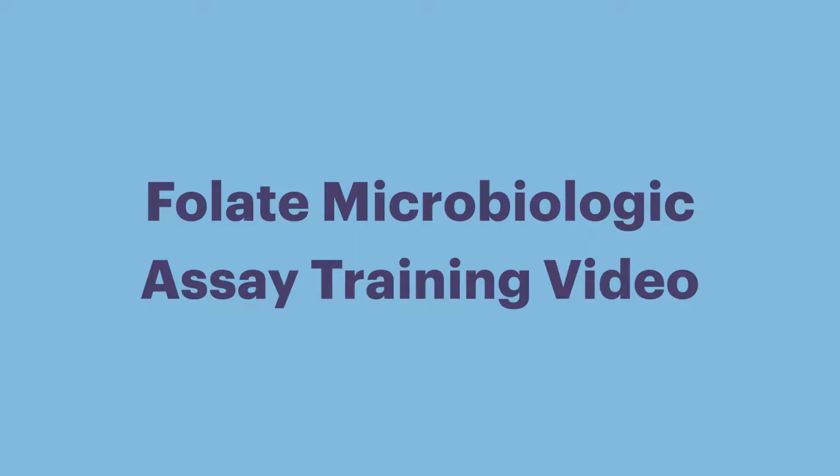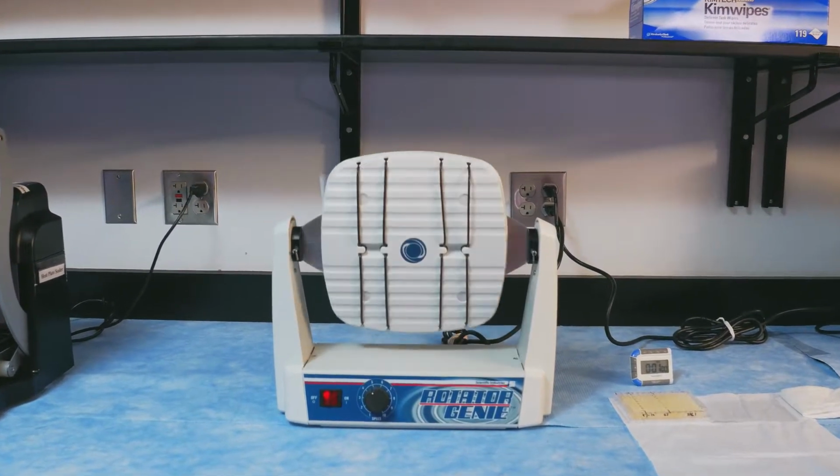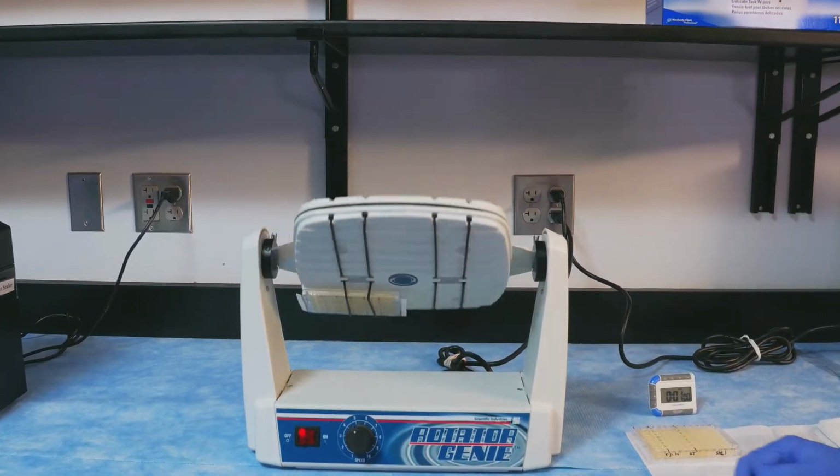Welcome to the Folate Microbiologic Assay training video. The purpose of this video is to demonstrate key steps of the Folate Microbiologic Assay.